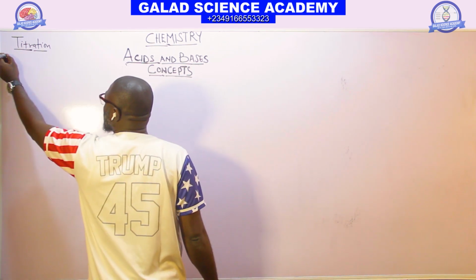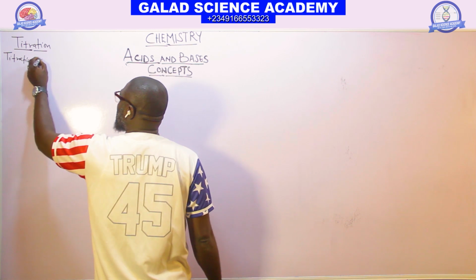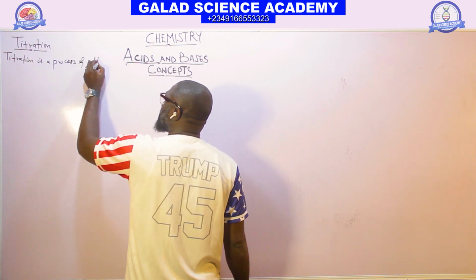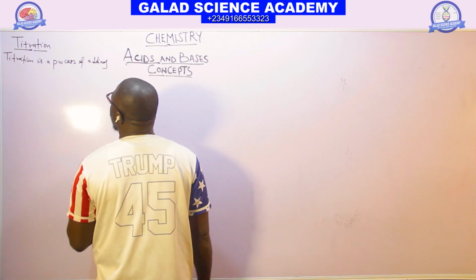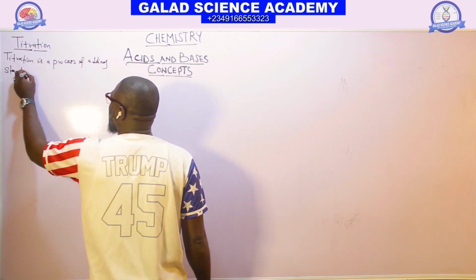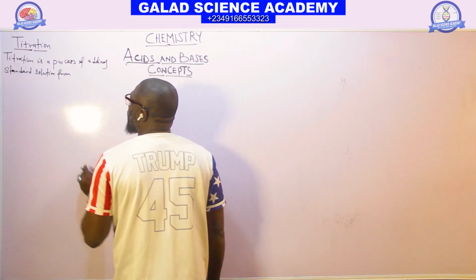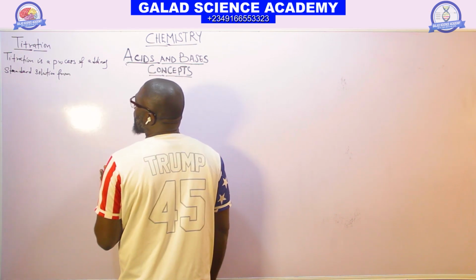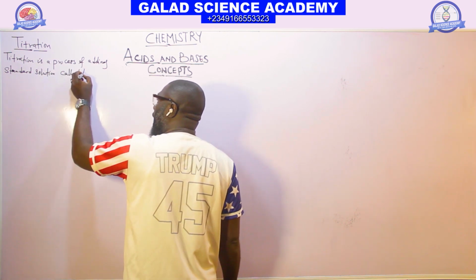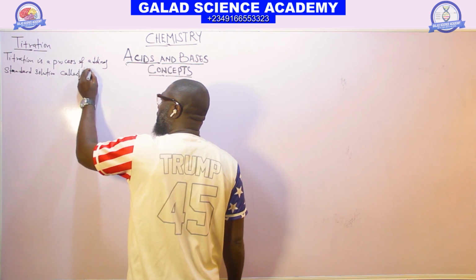Titration is a process of adding standard solution from a burette. The standard solution is called titrant.